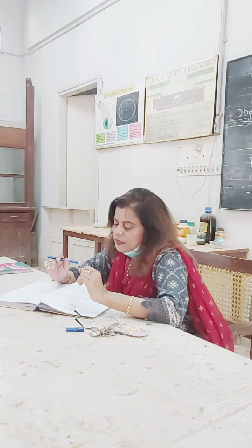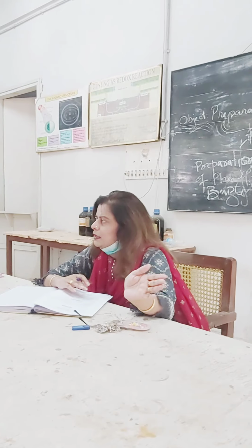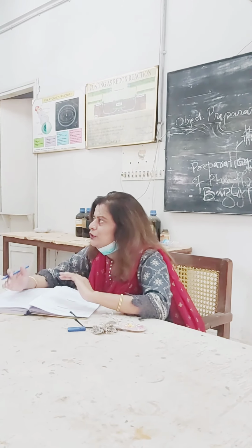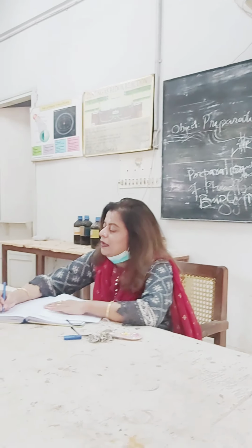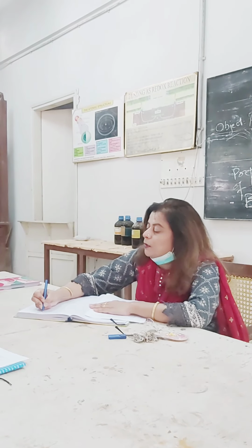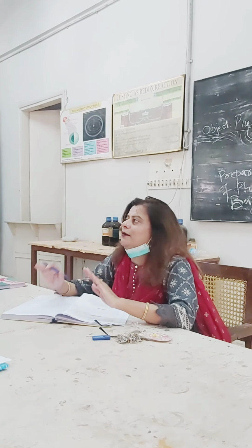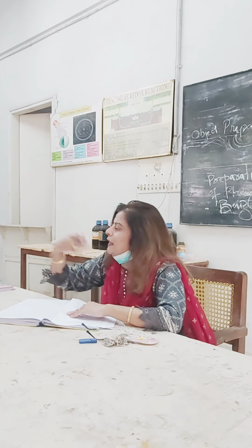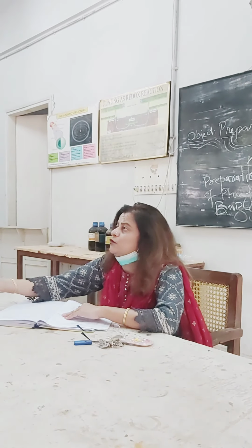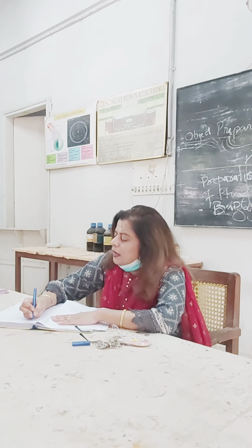So we are going to move on with the availability of our chemicals that are present in our lab, right? I will check which chemicals are there, and then we can proceed. So how are you going to start? You will simply write down experiment number 1 in your journal, and you will do everything directly on the journal. You are not going to copy from rough registers and then into the journal. No, do it directly. Write down the experiment, write down the date, and start working.